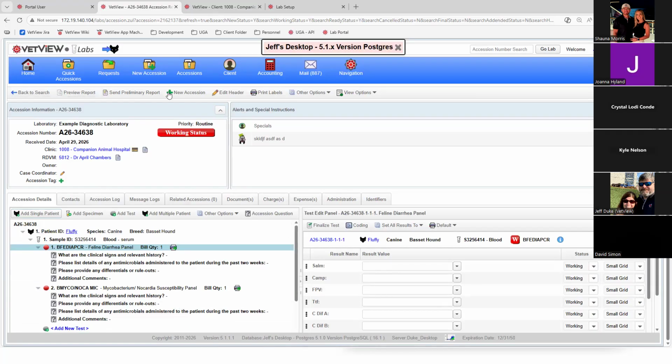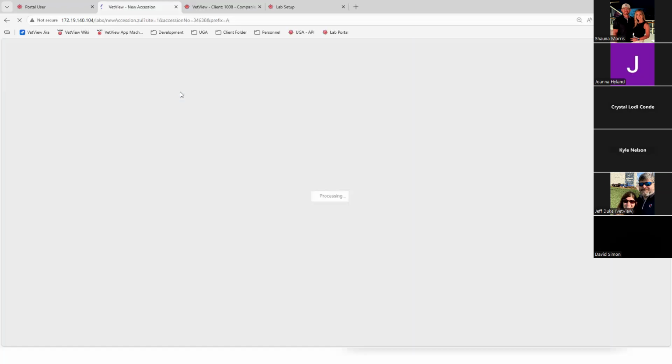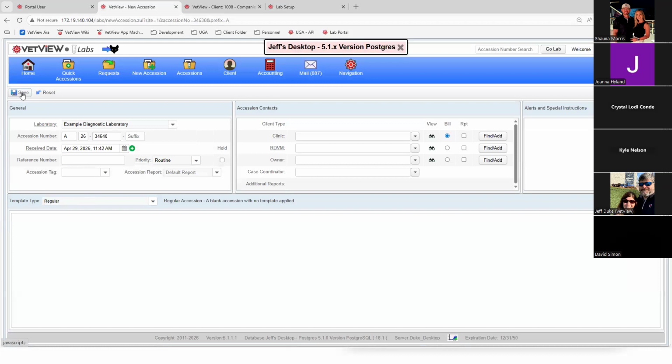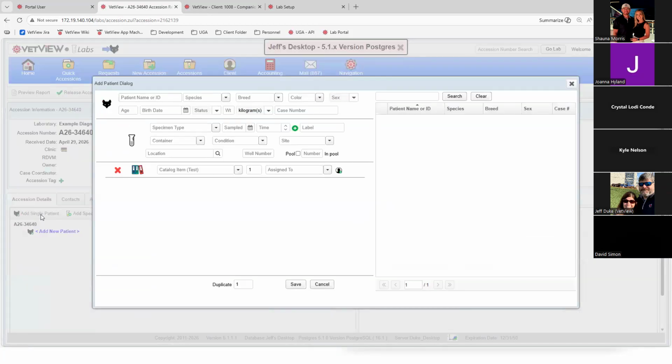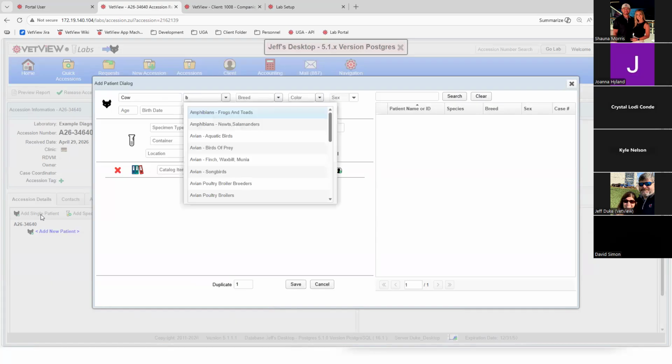And so let's do what a large case process might be. And again, you can pick and choose which processes work best for you. So I like to start here. There's a lot of ways to accomplish this, and that's on purpose. So each person may find what works best for them for the scenario that they're putting in here. So let's say I start with cow. I'm just going to start with a basic bovine there.